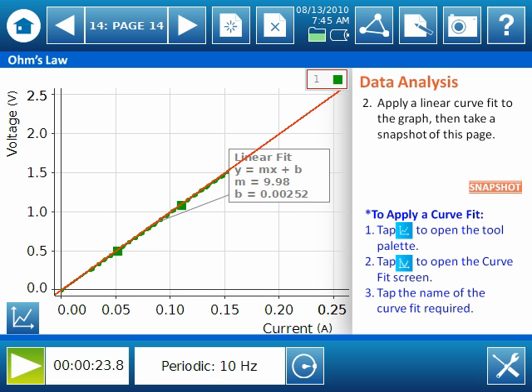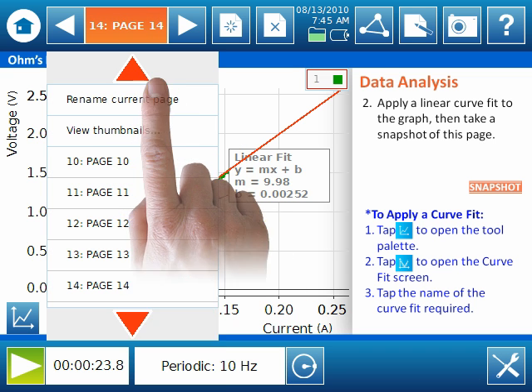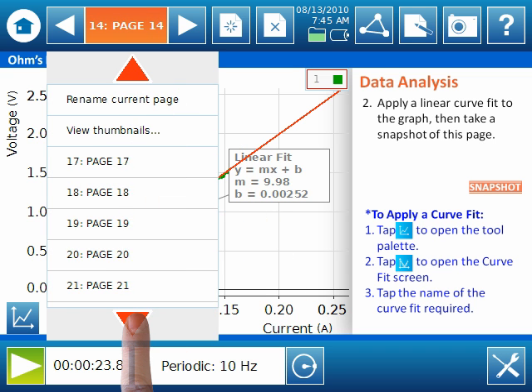This specific lab actually has three similar parts, so we'll move forward to the post data analysis sections. To do that, we'll use the Spark Science Learning Systems page navigator tool.